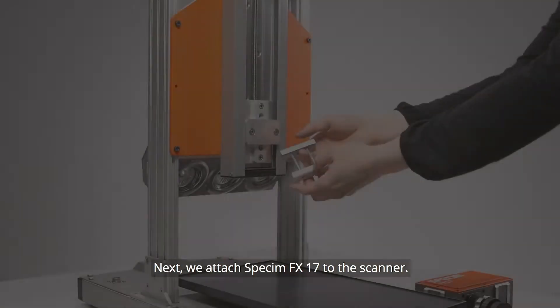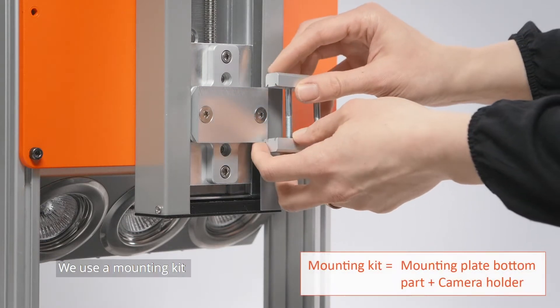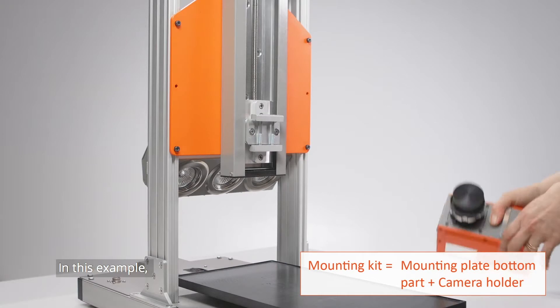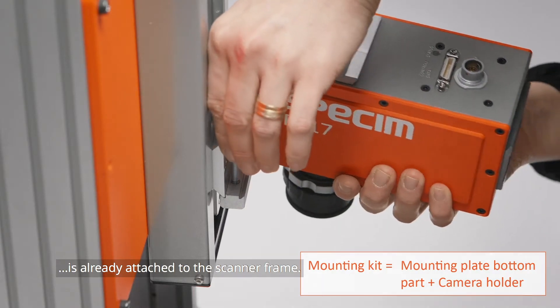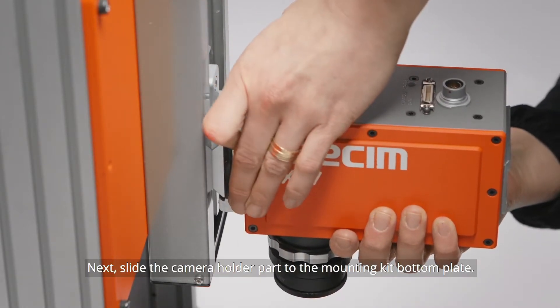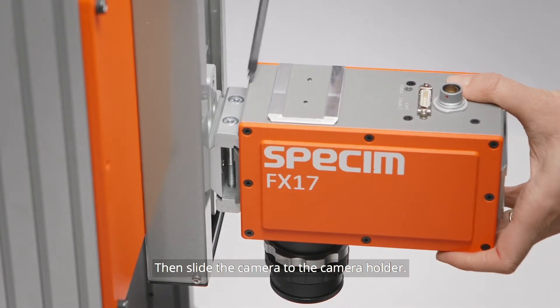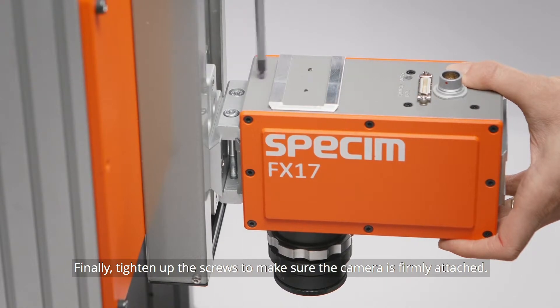Next, we attach the Specim FX-17 to the scanner. We use a mounting kit specifically designed for the Specim FX-Series. In this example, the mounting kit bottom plate is already attached to the scanner frame. Next, slide the camera holder part to the mounting kit bottom plate. Then slide the camera into the camera holder. Finally, tighten up the screws to make sure the camera is firmly attached.